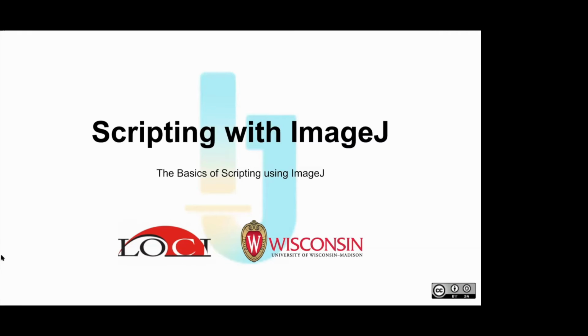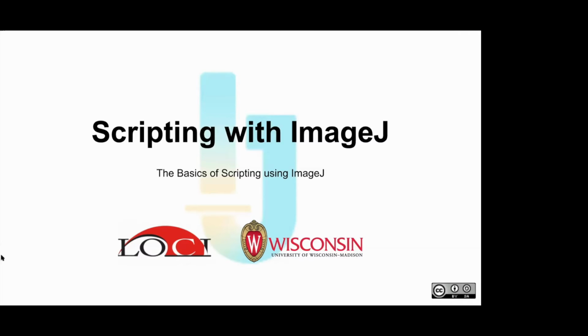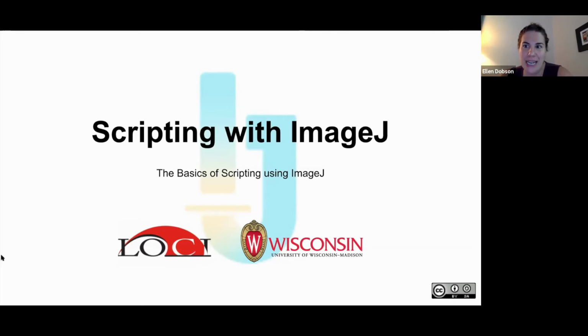Yeah, so I think that is an excellent question to pose on the forum and gauge what the community thinks is the best answer. I think I remember reading something like this on the forum, and I believe people used an average projection to do those types of measurements.